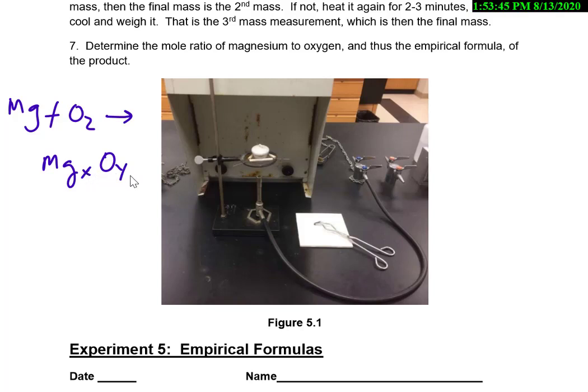So the point of finding an empirical formula is to determine the values of these x's and y's here, the mole-to-mole ratio. Now from our periodic table, we know that magnesium has a charge of +2 and oxygen -2. So this one we can actually predict that the empirical formula should be a 1-to-1 mole ratio. Of course, lab doesn't always turn out that way. So we'll be using the measurements given and provided in the data to then calculate and see the empirical formula that we come up with.